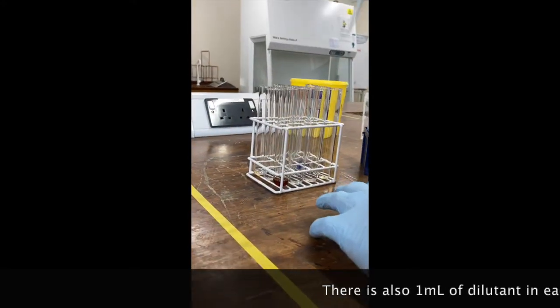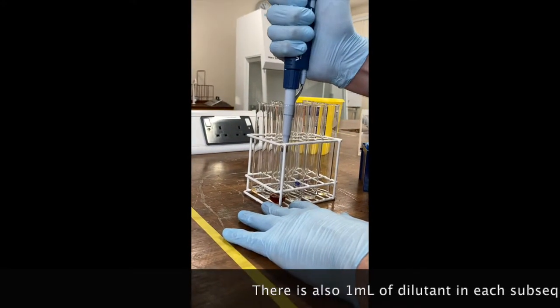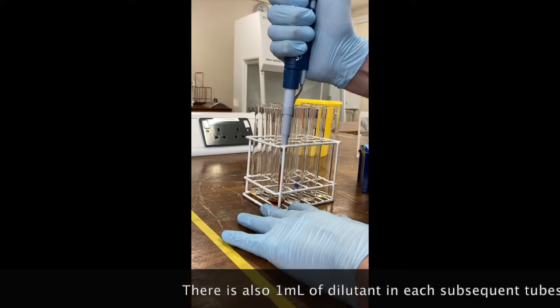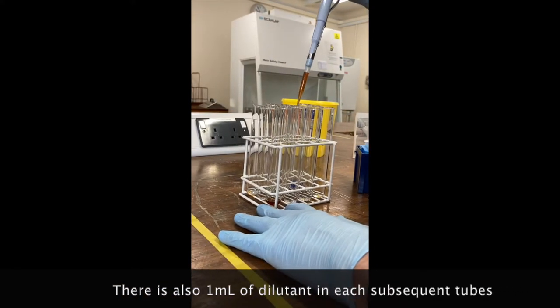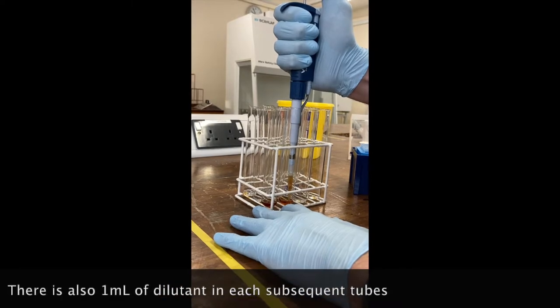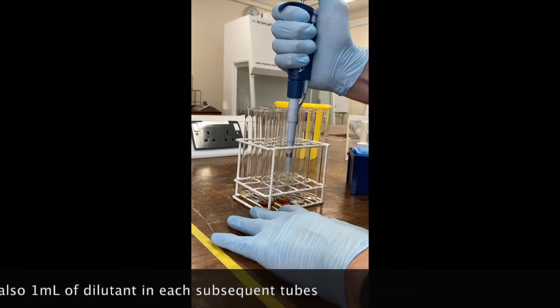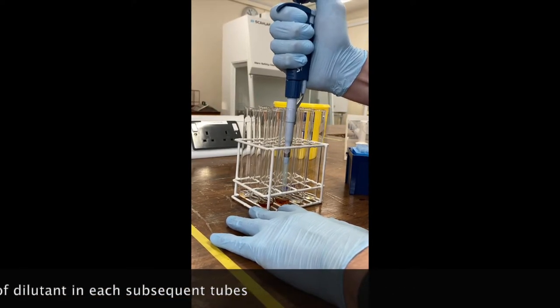Put the pipette on, go down, I'm going to take one mil up, making sure there's no air bubbles in the pipette. I'm just going to mix that by pipetting up and down gently into the second tube.